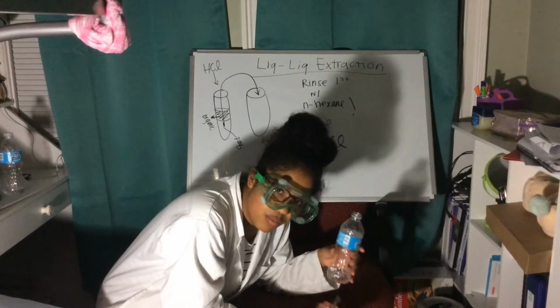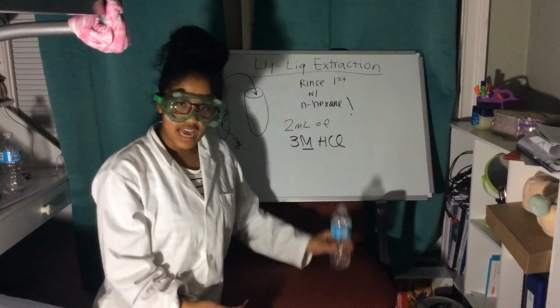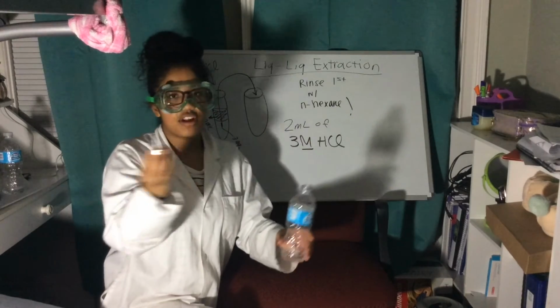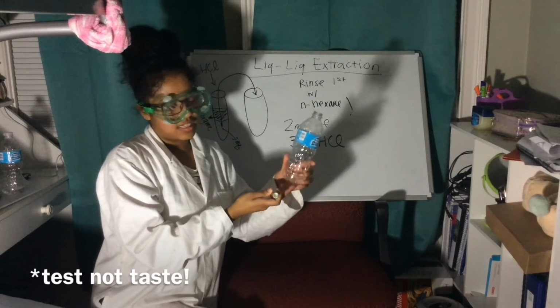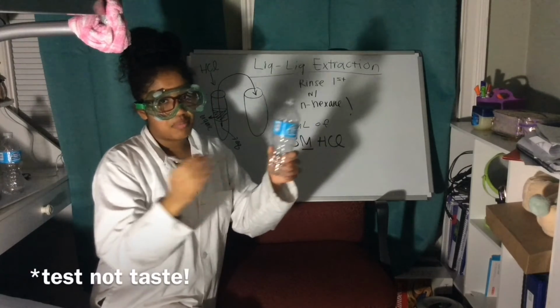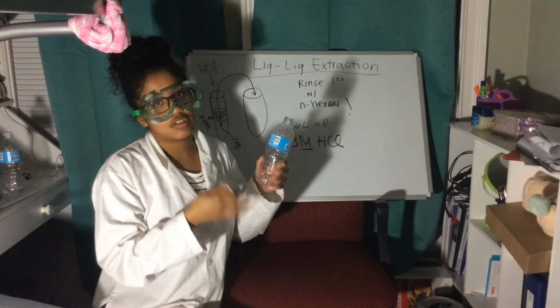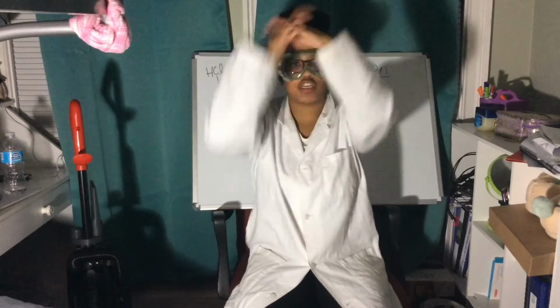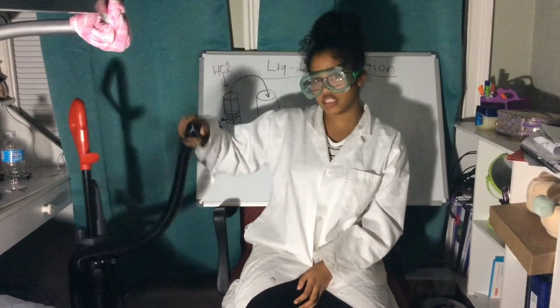Solubility! Once the liquid-to-liquid extraction is done 2 times, we place it in an ice bath and add KOH dropwise to the solution. This is a very basic compound, and we test the basicness of the solution on a piece of pH paper. The purpose of this is to help freebase the lidocaine hydrochloride compound. After a sufficient amount of cooling, we then vacuum filtrate the crystals to collect the solid.